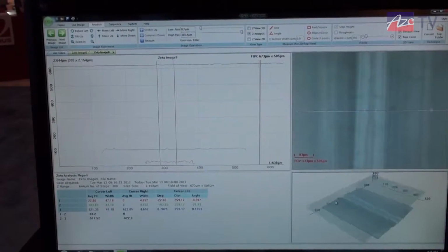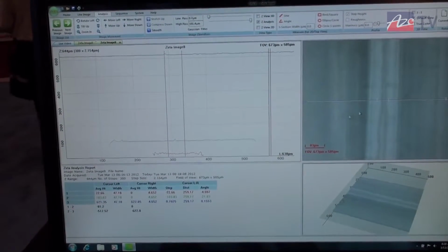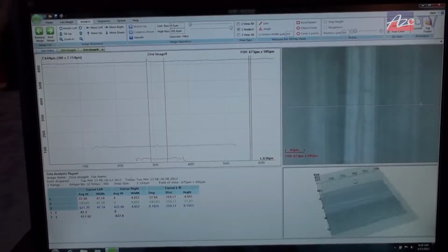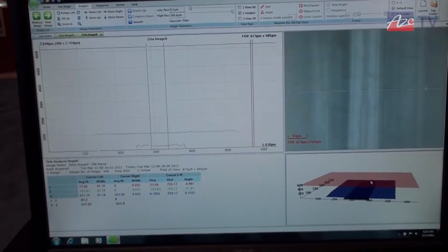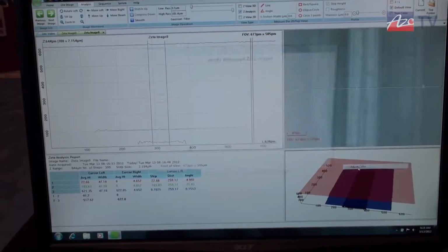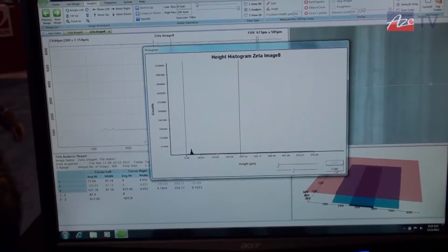And so now I can actually see this. It is made out of plastic, so it's no problem collecting it. The color information that came back is the white light reflected color of the actual sample. Should I want to use false color to actually look at this, I can simply click on that value, and based on the information that's present, I can change the color histogram or adjust my color scale based upon the information that I'm displaying, such as something like this, so I have a difference in the sample.